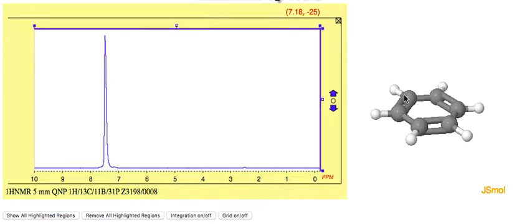But again, the ring, and the electrons in the super pi bond business going here, those electrons are being pulled away from the area of the hydrogens out of their plane. And so we're going to have a de-shielding effect. As a matter of fact, this is the region of the spectrum that's indicative of benzene. If you have a molecule that has a lot of degrees of unsaturation, you know there are double bonds and rings. This has 4 degrees of unsaturation, the ring and the 3 pi's.